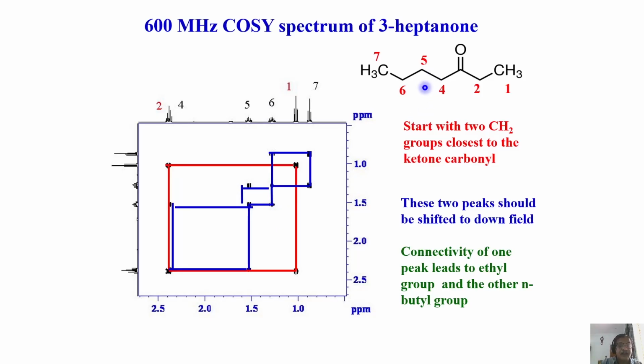Now go down further. 5 is coupled to 4. That is also understood now. So very clearly, you could identify all the spins in this group sequentially, and find out this is coupled to this, coupled to this, coupled to this. You identified all the peaks and you identified this coupled spin system as a separate independent group.